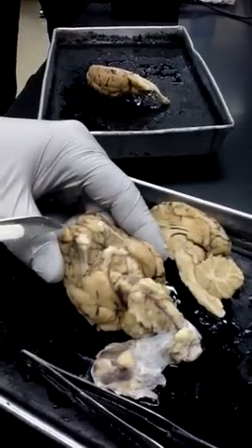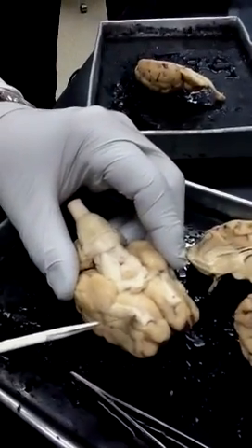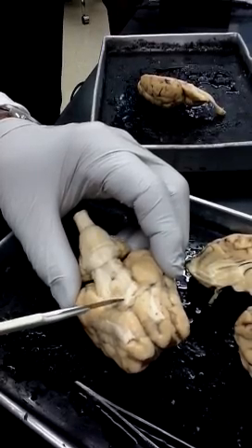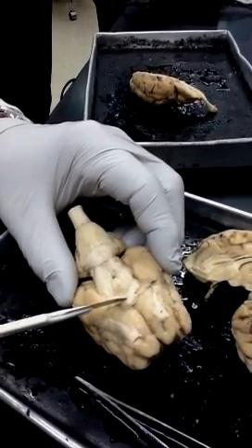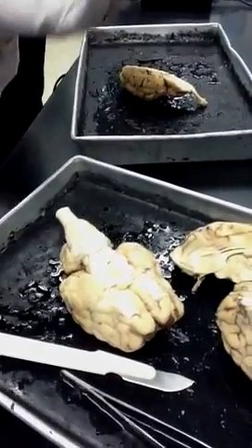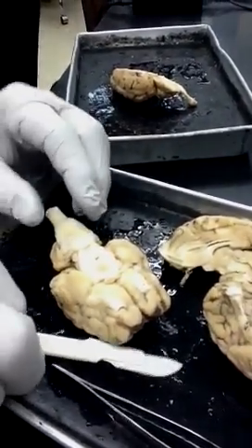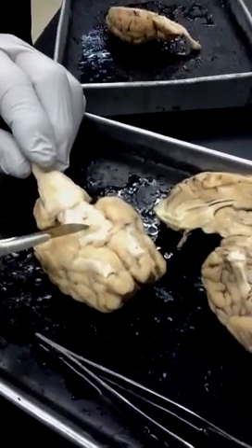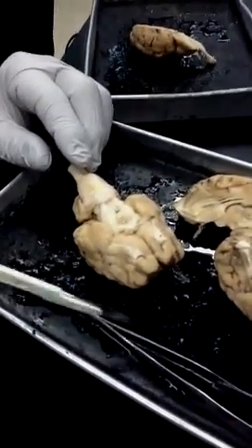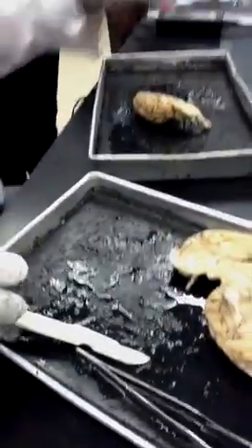Optic chiasm, although not too good on this particular brain. Olfactory bulbs, and where the optic nerve crosses right in the center, right there, is the optic chiasm. The word chiasm means cross, so the optic nerve just kind of comes in and crosses like that, because basically the right eye goes to the left side of the brain and vice versa. I guess it's the same in sheep. Is the pituitary gland underneath there, right? The pituitary gland, if it was intact, would be sitting right here. X marks the spot. It's just right in back of the X. Although this sheep brain doesn't have a pituitary gland. None of them do, at least the ones we have in here.